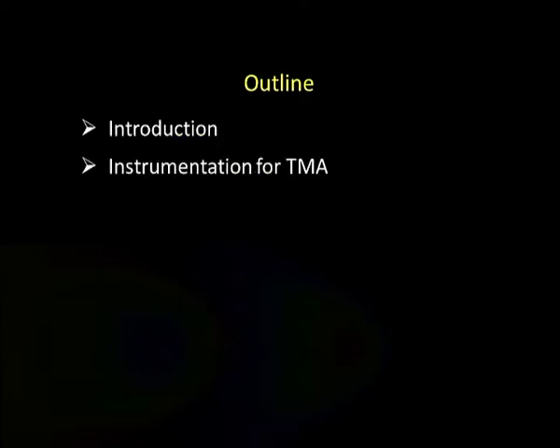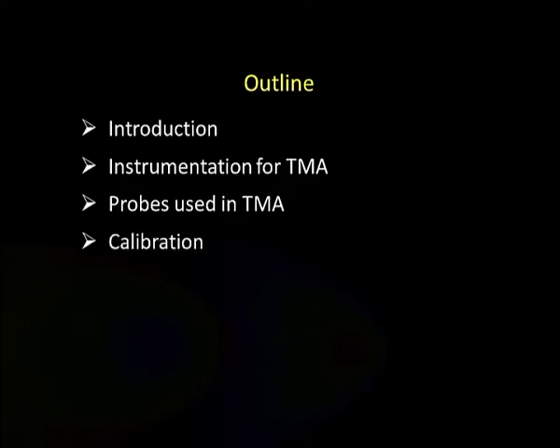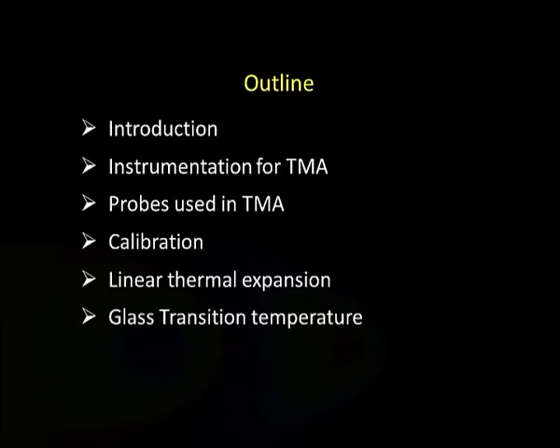In this lecture we will talk about instrumentation for TMA, that is thermal mechanical analysis or thermomechanical analysis, probes used in TMA, calibration, linear thermal expansion, glass transition temperature and the applications of TMA.